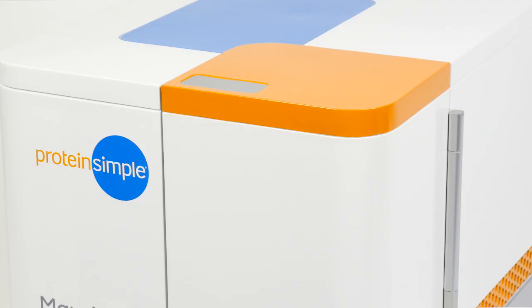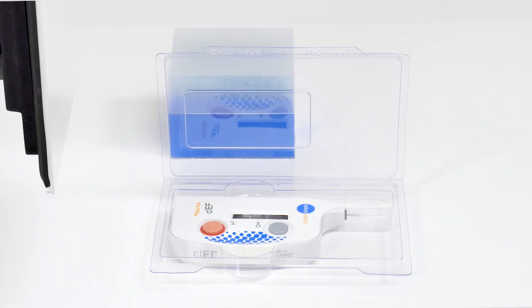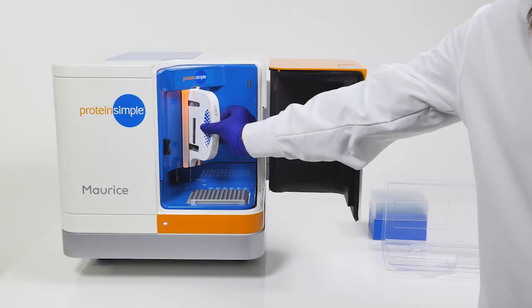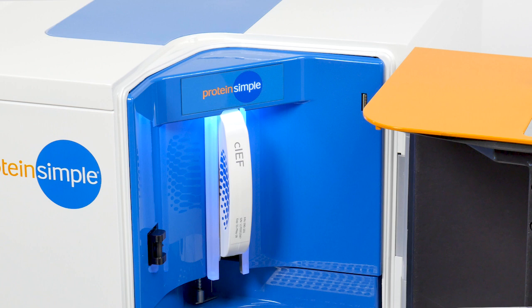Maurice's door is opened by touching the silver plate on top of Maurice. Looking into the Maurice loading chamber, you will notice that the LED lights on either side of the opening for the cartridge are orange. These lights will turn blue when the cartridge is properly loaded. To load the cartridge, hold it vertically by the finger holds on either side with the capillary inlet port pointing down. Take care not to bump or scrape the capillary inlet port in the process of inserting the cartridge into the slot in Maurice.